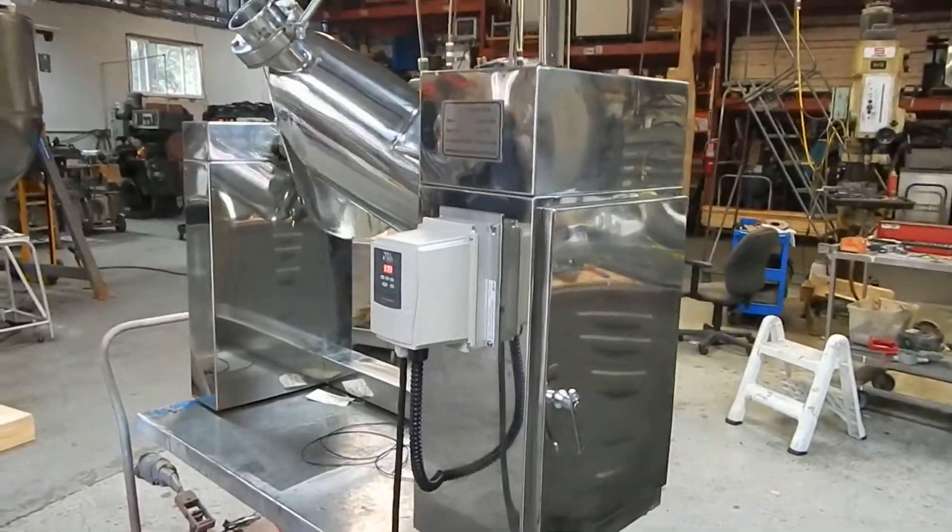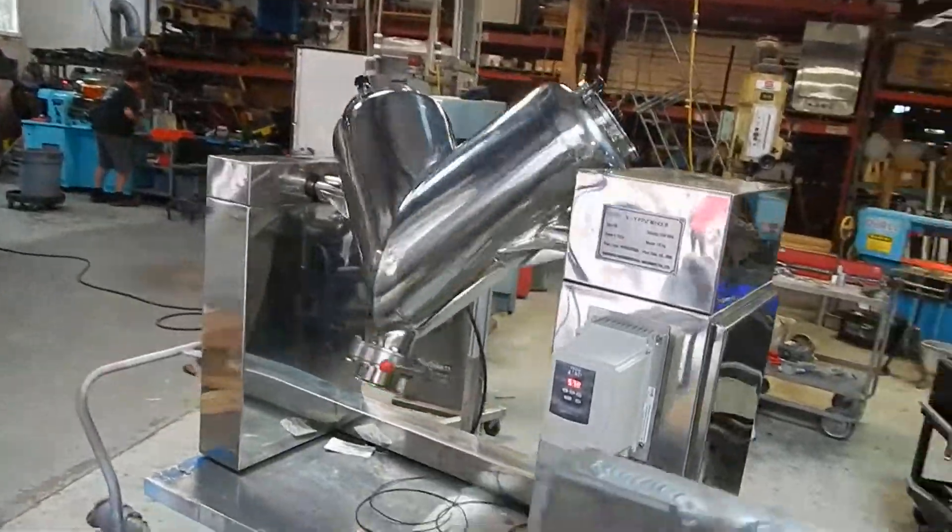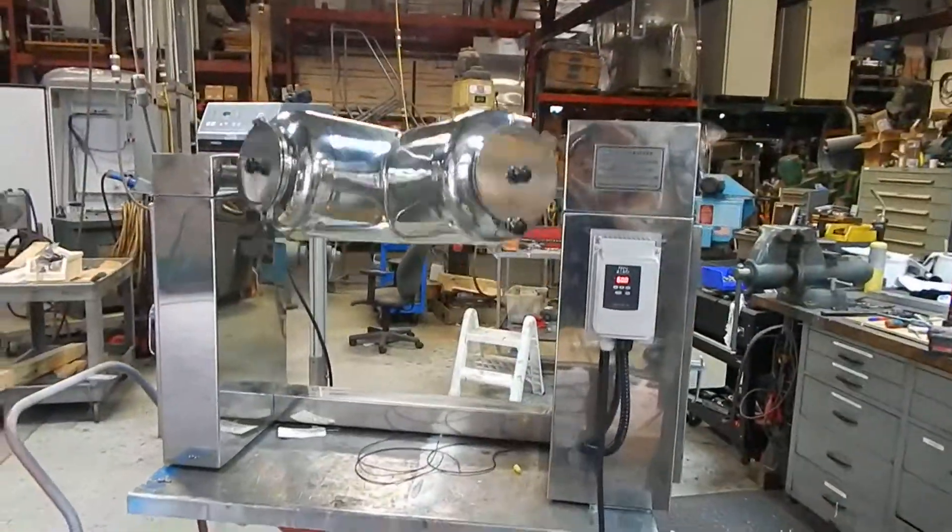We have lots of blenders in our stock: twin shell, double cone, ribbon blenders, paddle blenders, and of course everything in processing and packaging.